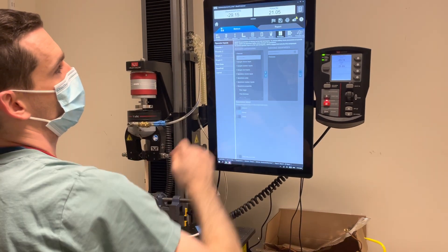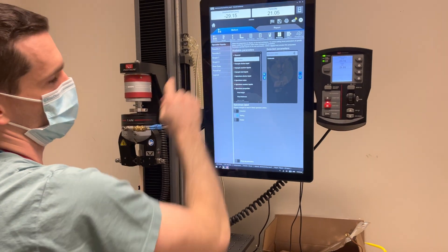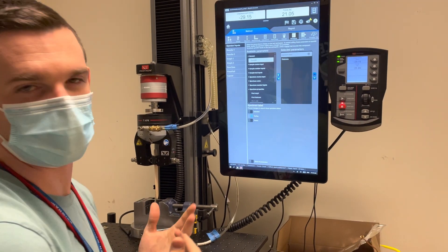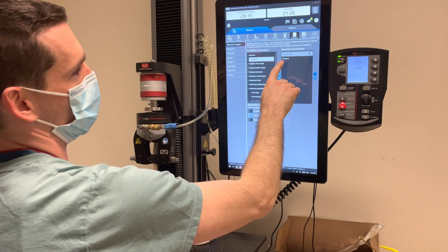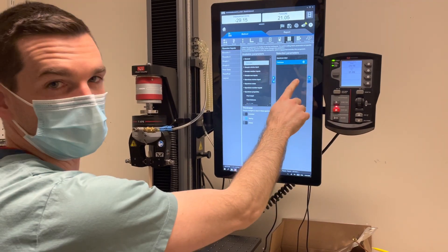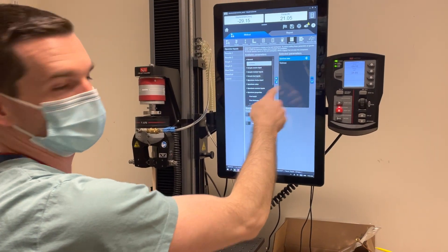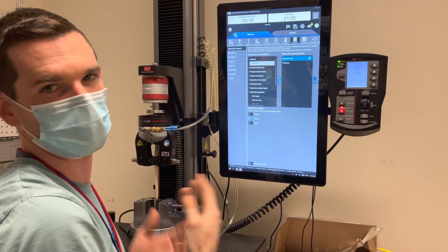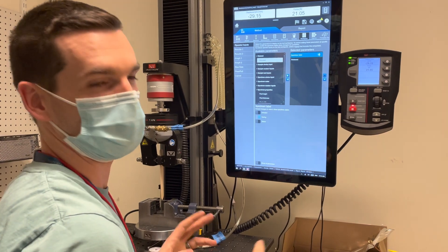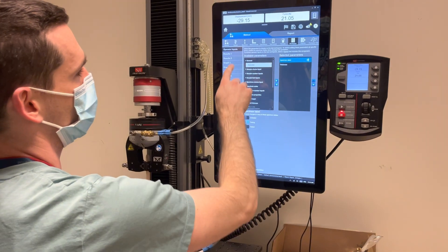In the workspace, I'll have some optional inputs. If I have samples that change in thickness, for example, I can choose thickness as one of these values — a little field I can fill in before each test. Sometimes I want to put in a label, so if I have different types of samples, I can type in a different name for each sample. You can include those as optional fields.